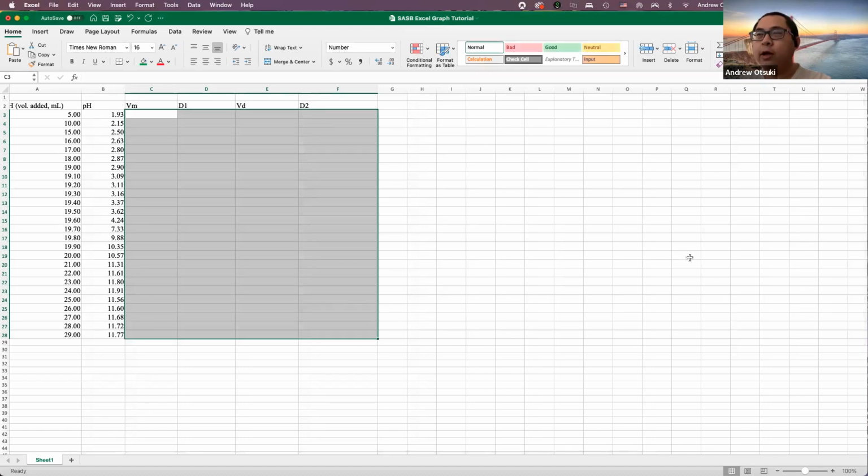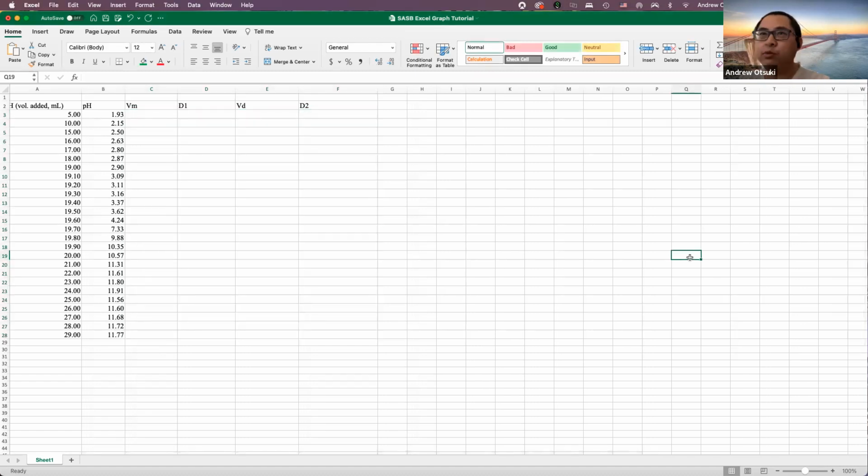Okay, everyone. So I know it's kind of late, but I just wanted to make a little tutorial about how to do these Excel graphs because when I opened Excel, I kind of got lost myself. So let's go through this.